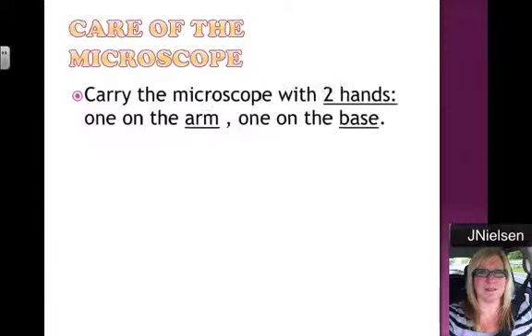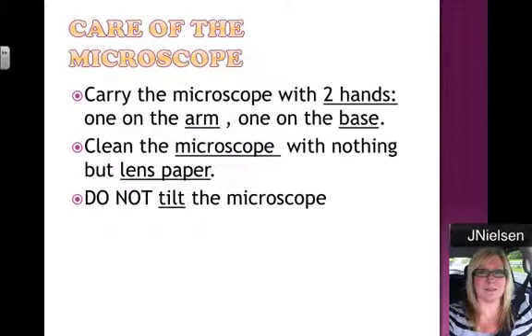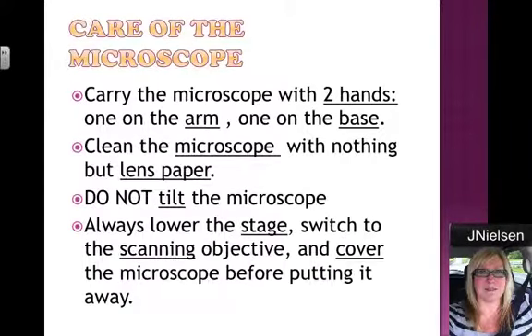Care of the microscope: carry the microscope with two hands — one on the arm and one on the base, which is the bottom. Clean the microscope with nothing but lens paper, and when we take out the microscope for the first time in class, I will show you how to do this. Do not tilt the microscope. Always lower the stage. Switch to the scanning objective, which is the smallest objective. And cover the microscope before putting it away.